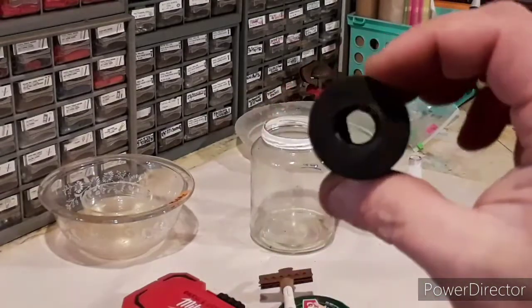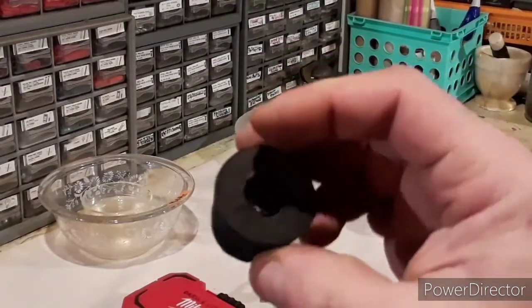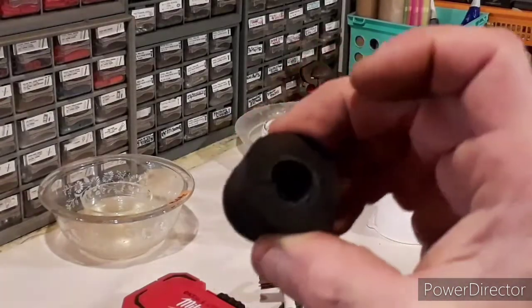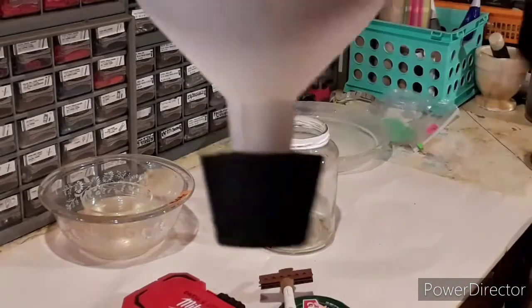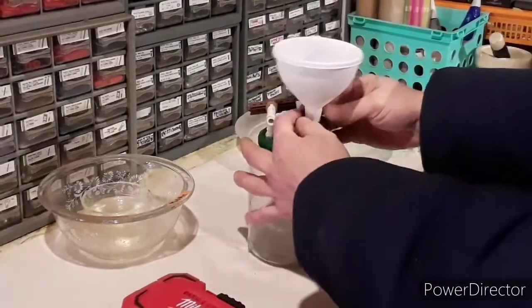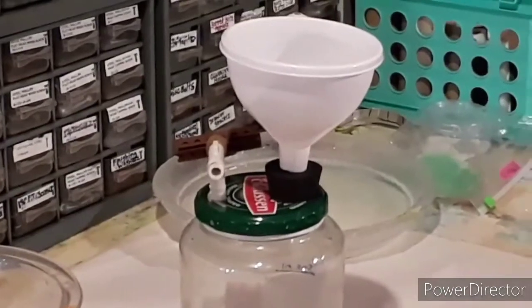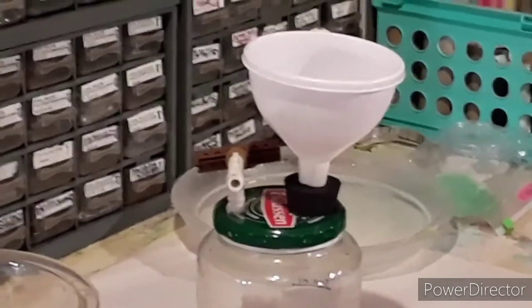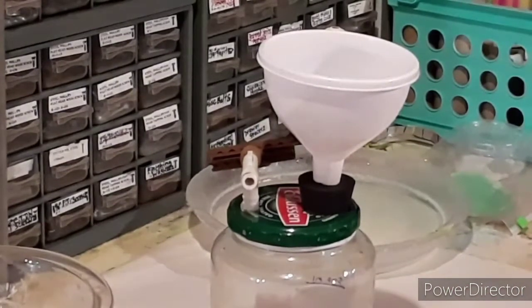If your stopper doesn't already have a large hole in it, you'll need to bore it out. I recommend buying a decent set of cork borers — they're the easiest way to bore out a rubber stopper. Just bore it big enough to get your funnel in and make sure the funnel makes a good seal. Then put it all together and you have an all-in-one portable device for both vacuum filtration and gravity filtration — just disconnect the pinch clamp and gravity filtration works quite nicely too.